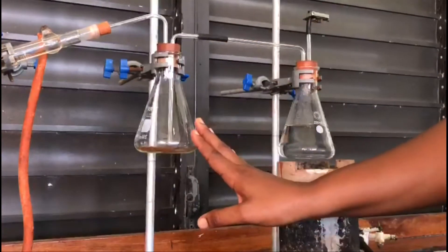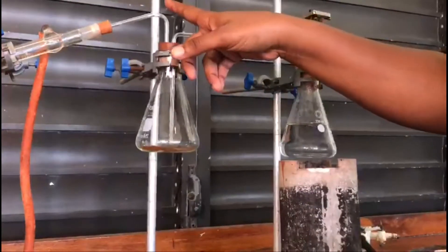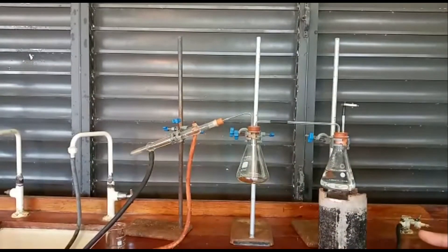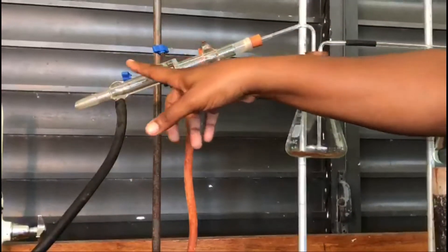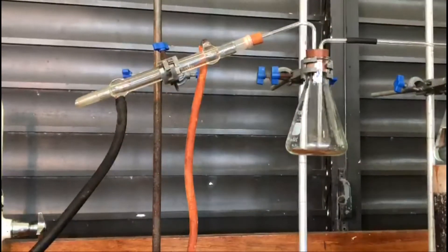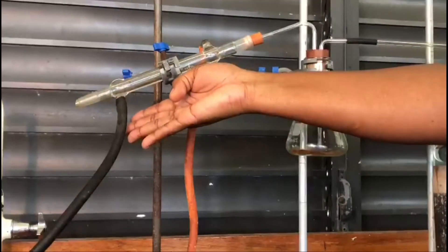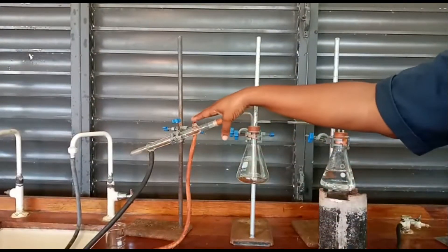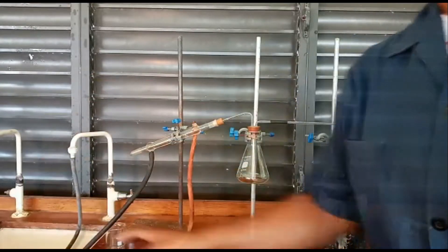The distillate, as it leaves as vapors, is going to enter my Liebig condenser. The Liebig condenser is a water-filled condenser with two envelopes — an outer envelope with water and an inner envelope through which my distillate is going to pass. I have two sets of rubber tubing: the black tubing at the bottom is my water in, connected to my tap, and the orange tubing at the top is the water out, which simply runs to my sink.